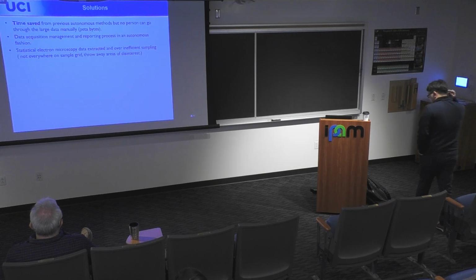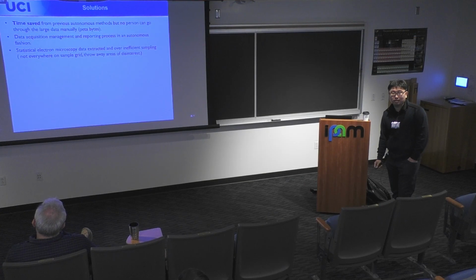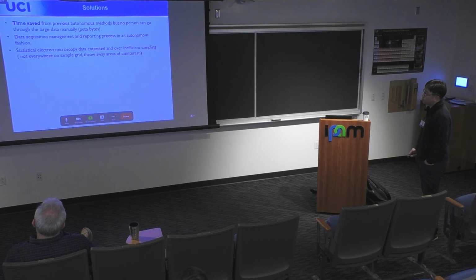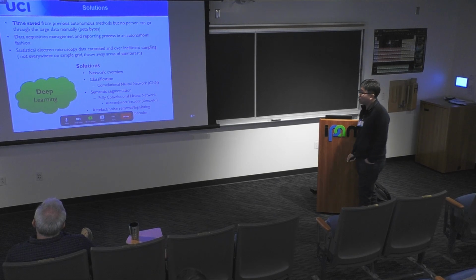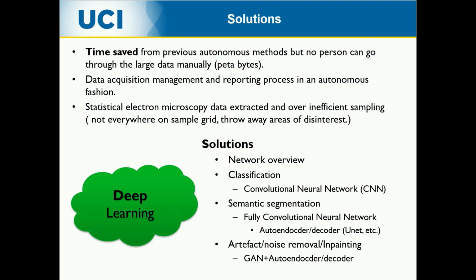That's a good question to ask, right? Now, we show that you can automate the TEM to do a lot of workflow. And you have the new detectors that can actually give you petabytes of data in a day. Well, we know for petabyte data, even reading it using our workstation will take at least hours, if not days. So the human being cannot actually process all of this information. For now, the solution that can almost replace human beings to do this is the weaker form of artificial intelligence, which is deep learning.